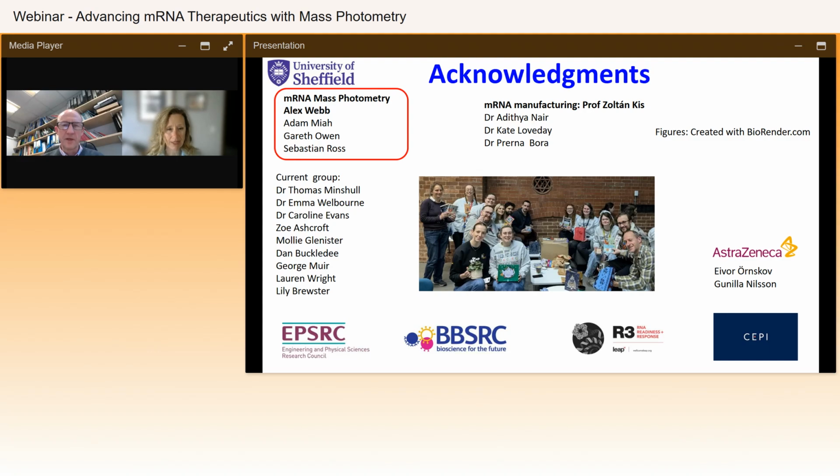Okay, thanks for the question. Not exactly sure which slide that might have been pertaining to. I think we're talking about summarizing some of the mass errors on the accurate sizing. In a lot of the cases, we were able to achieve less than 1% error, depending on the type of mRNA that we're particularly analyzing. So for most of our applications, we were able to achieve less than 1%. So I think 5% perhaps is on the high side.